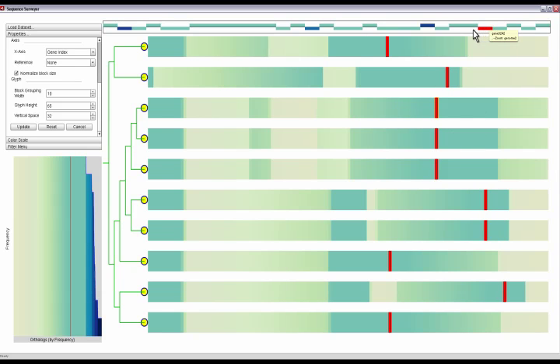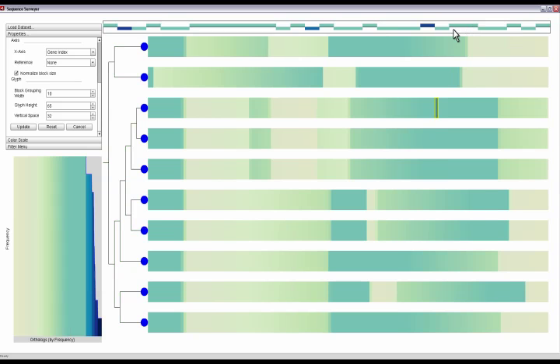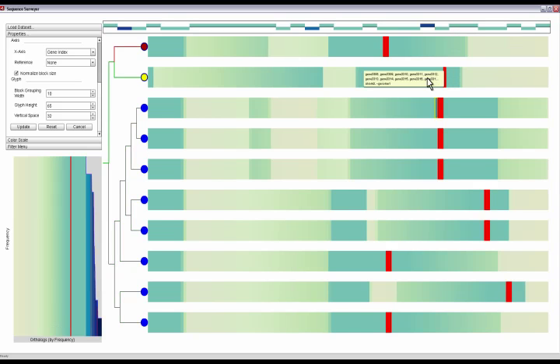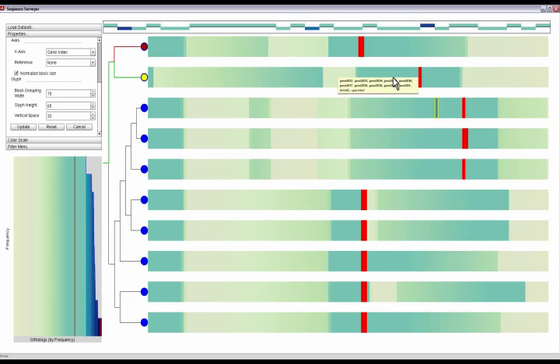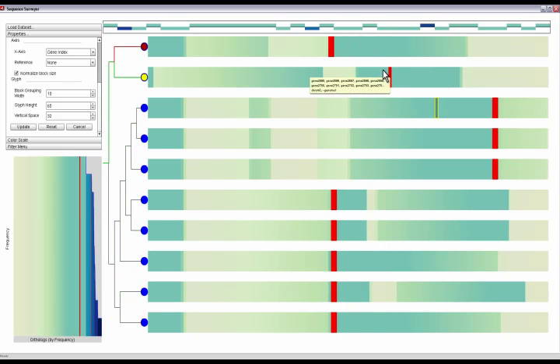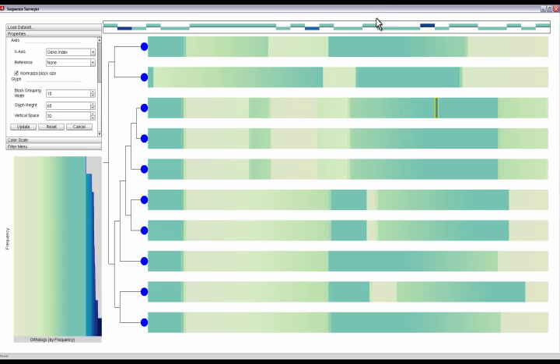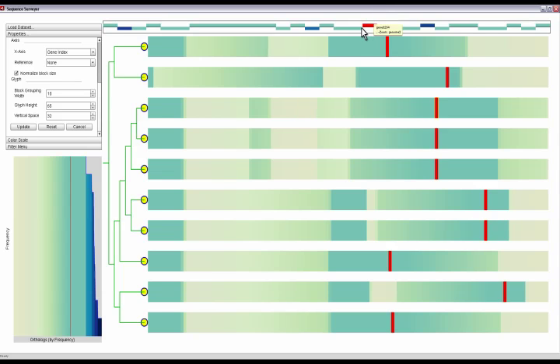When a block is moused over, other blocks with genes that match it are highlighted. Mousing over a gene in the zoom window also highlights blocks that contain that gene.